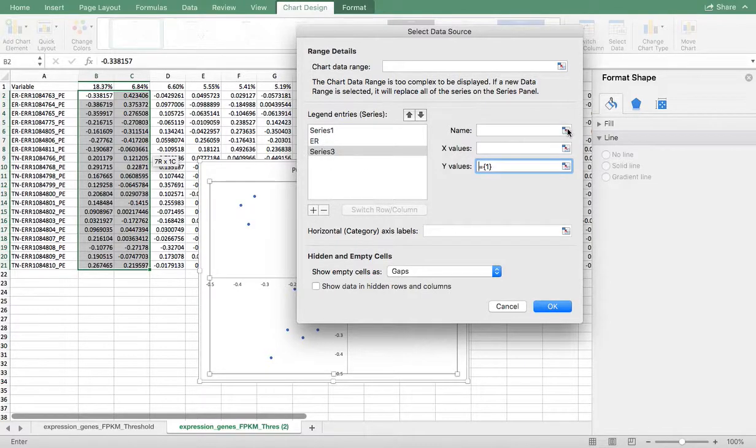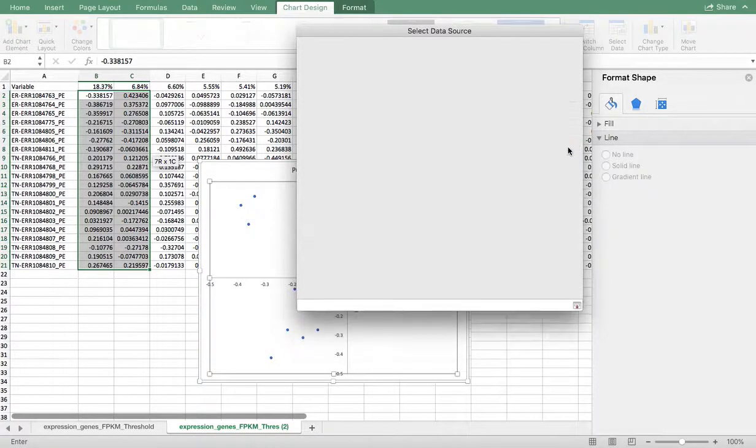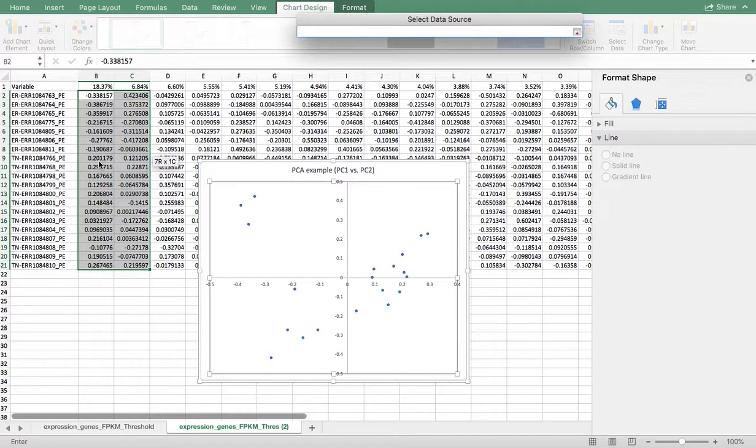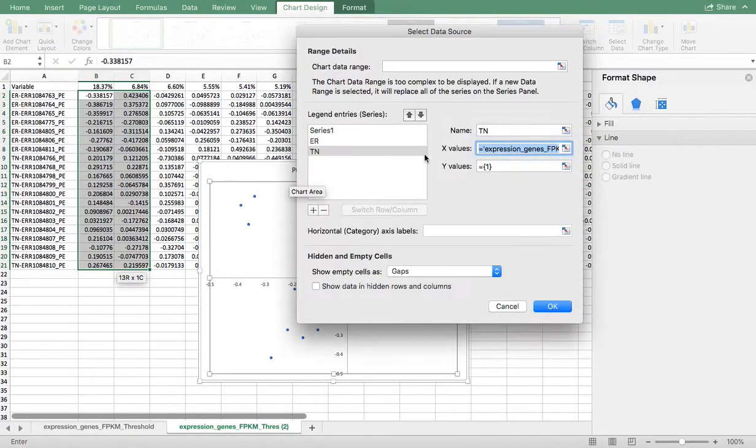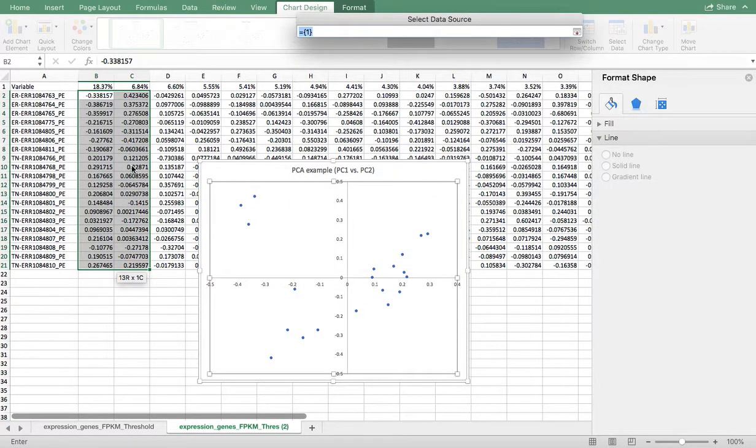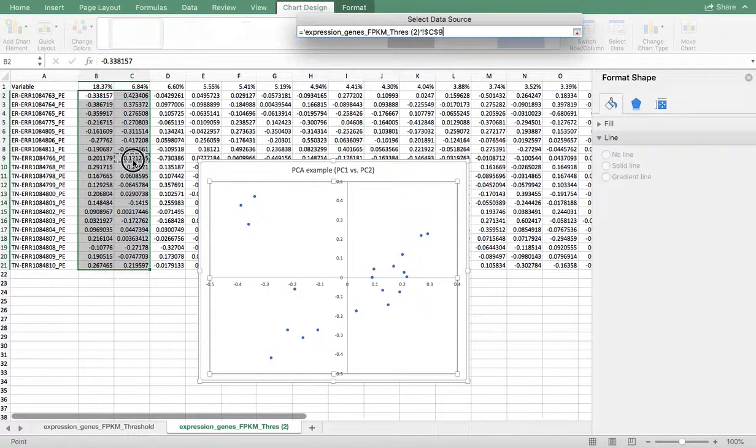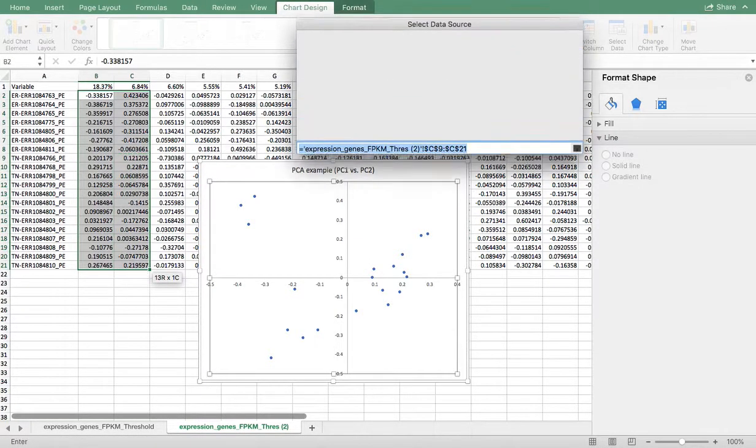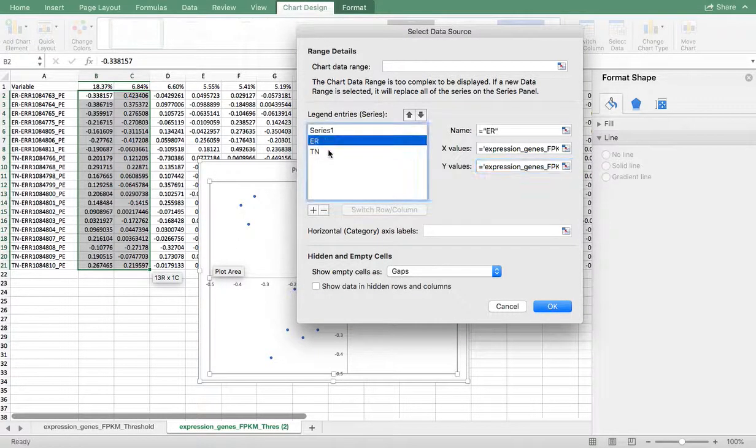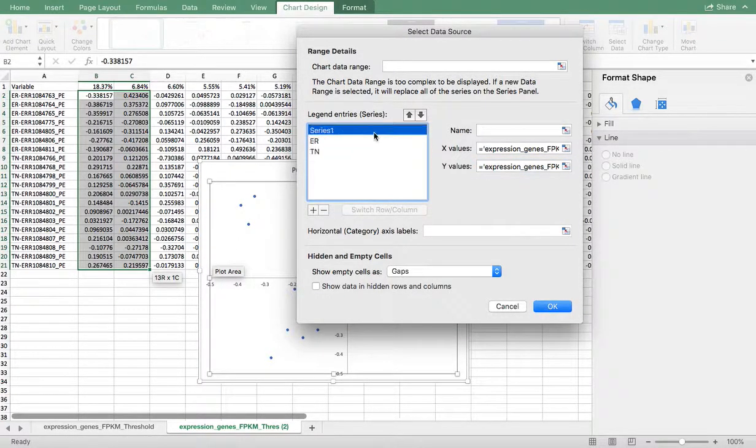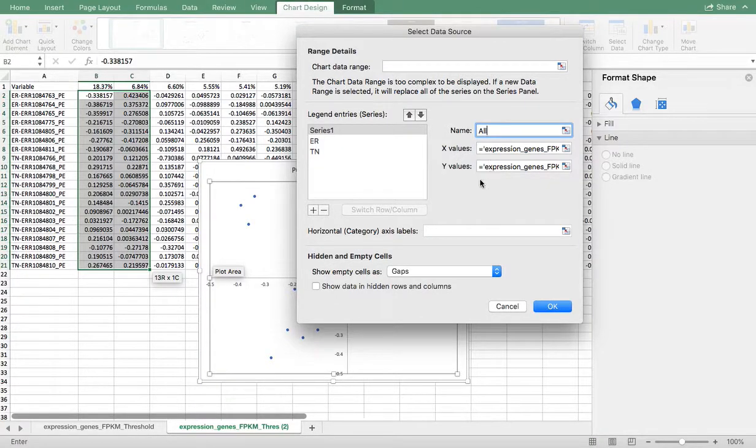Now I'm going to take TN, triple negative, and again I'm going to take the X values and the Y values. So now I've got ER and TN, and this is going to be called ALL.